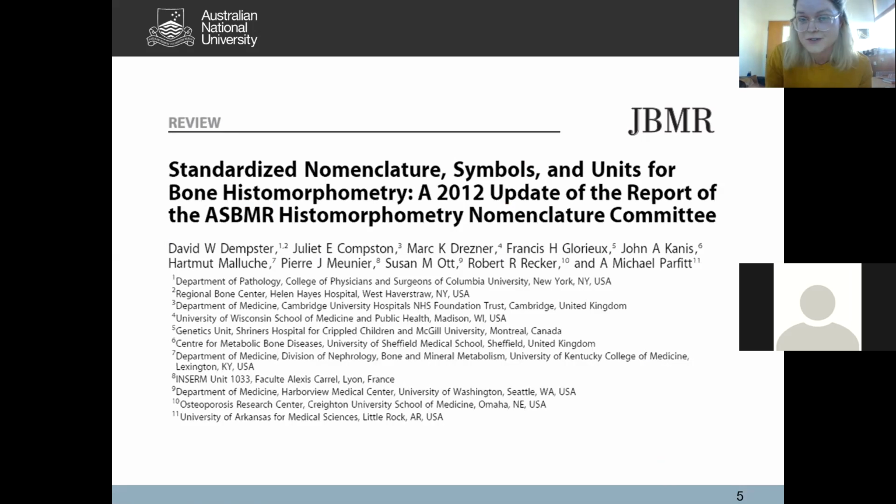Now, at this stage, I should also point out that when we're talking about geometric properties of secondary osteons, there's more that you can measure. It's not just the diameter and the area. You can look at circularity values, and there are several other things you could do, like aspect ratios or the inverse of the aspect ratio. Obviously, this is a very introductory session, so please feel free to go away, look into it a bit more, and play around with your samples. The world is your oyster, right?